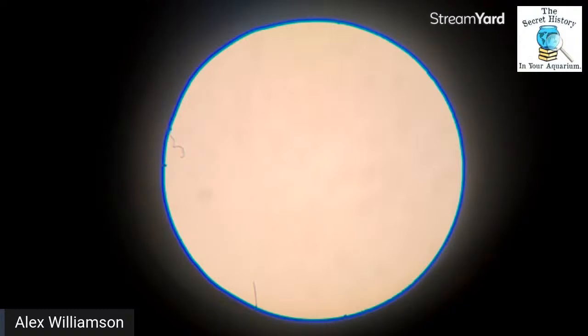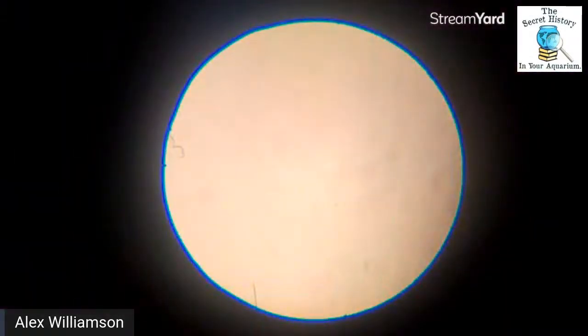I thought, you know, that if you drink from muddy water, that's probably where you're going to get sick. Now, I'm not saying that you wouldn't get sick from the water with that mulm there, but I'm just pointing out that it's not always what you expect that's filled with little critters. Sometimes it's the places you least expect that will be filled with little critters. So we're going to the next jar, which has been sitting in the room for a while. And so it's had a chance to gather up any cysts or things that would hatch in it. And so we'll look at that next.